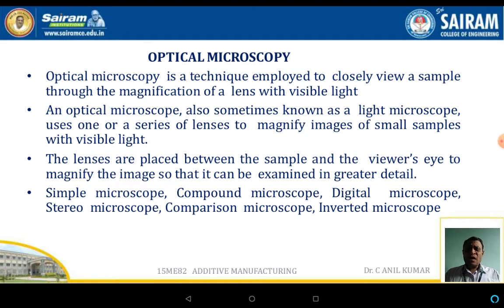Now here, the main question is what is the need of the study of optical microscopy? As we know, the optical microscope is used for magnification purposes. Optical microscopy is nothing but magnification through visible light.